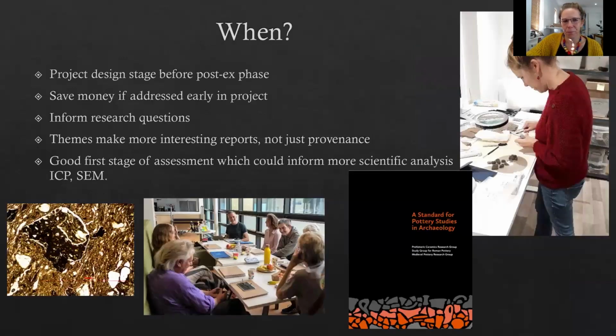Next slide, please. So when should you use petrography? This is very important and something that I come across working as a commercial petrographer. Really, it should be at the project design stage before you start doing the post-ex work. You need to set aside some money or set aside a question that could be asked by petrography and not have a surprise later on thinking, oh, actually, we've got to do this. Some petrographic analysis would be really useful, and then you haven't worked that into your budget. So it's always good to think about that at the beginning of a project, certainly the beginning of a research project or a commercial project.